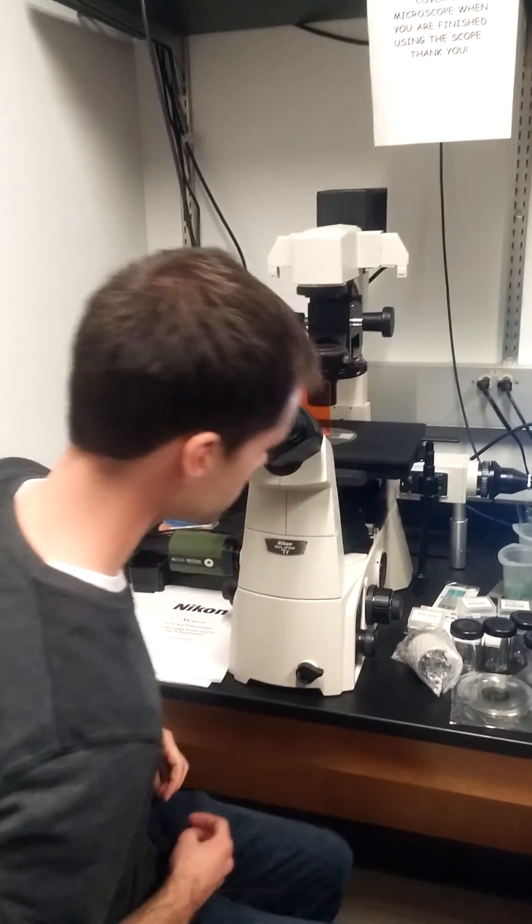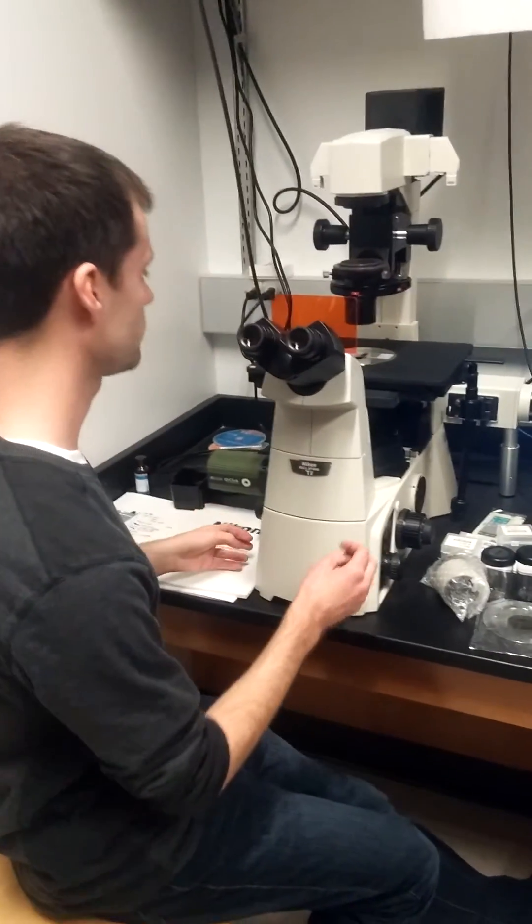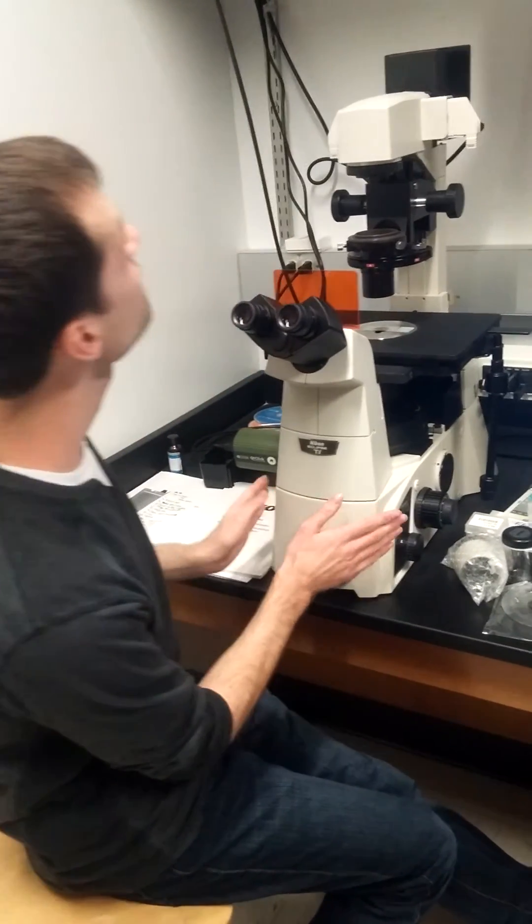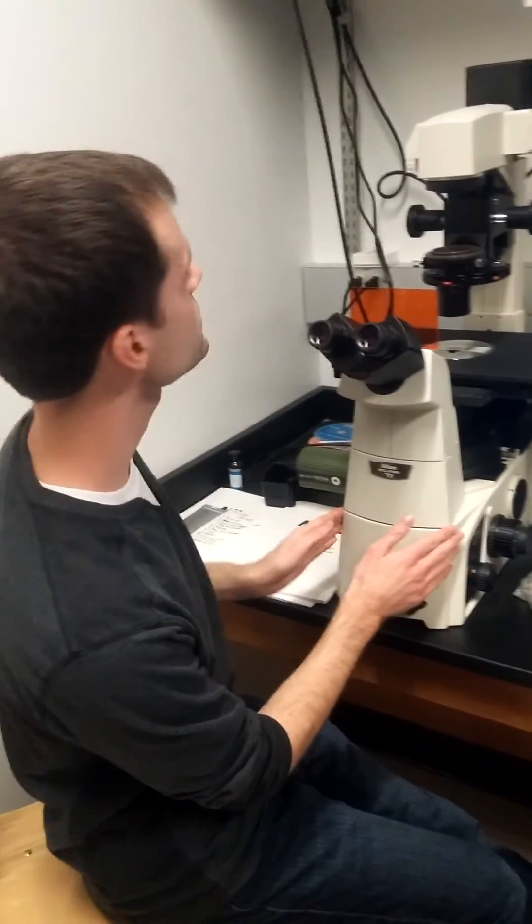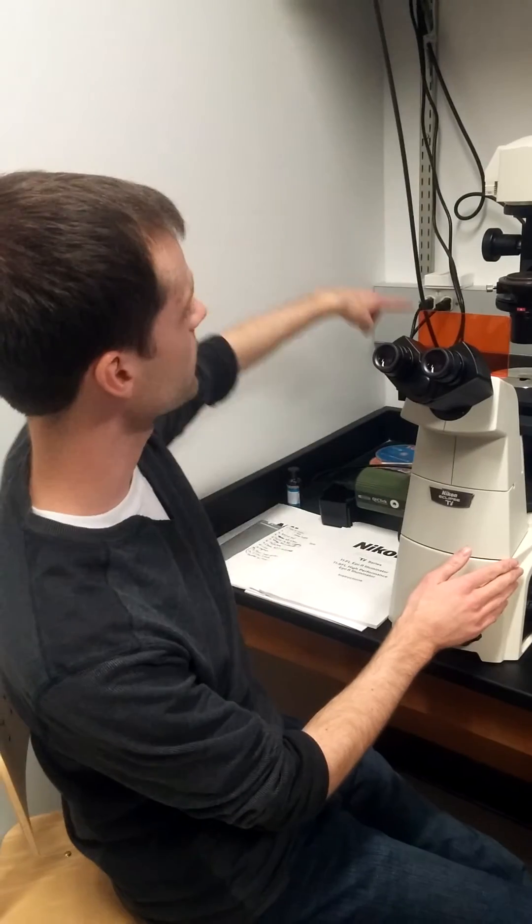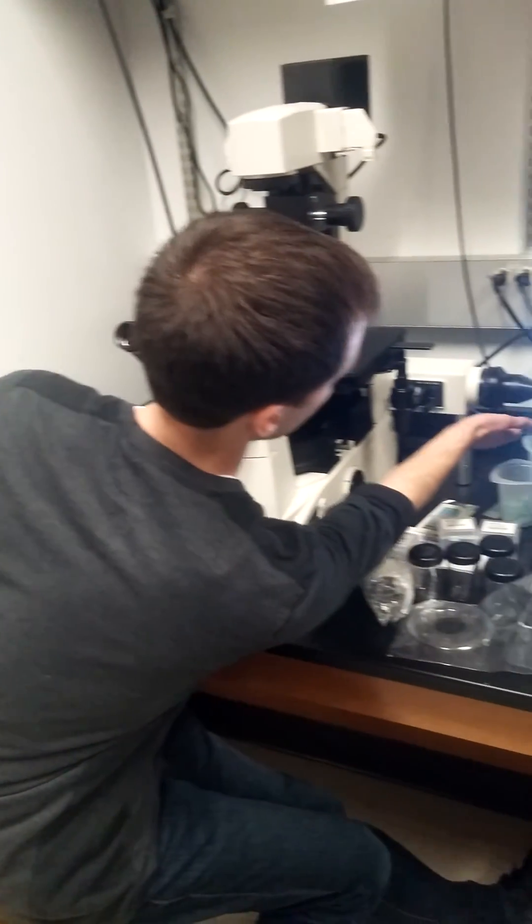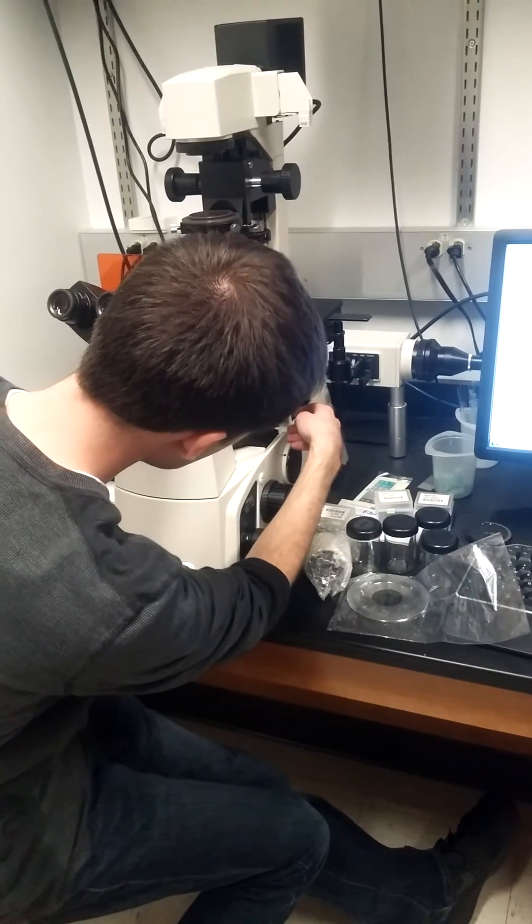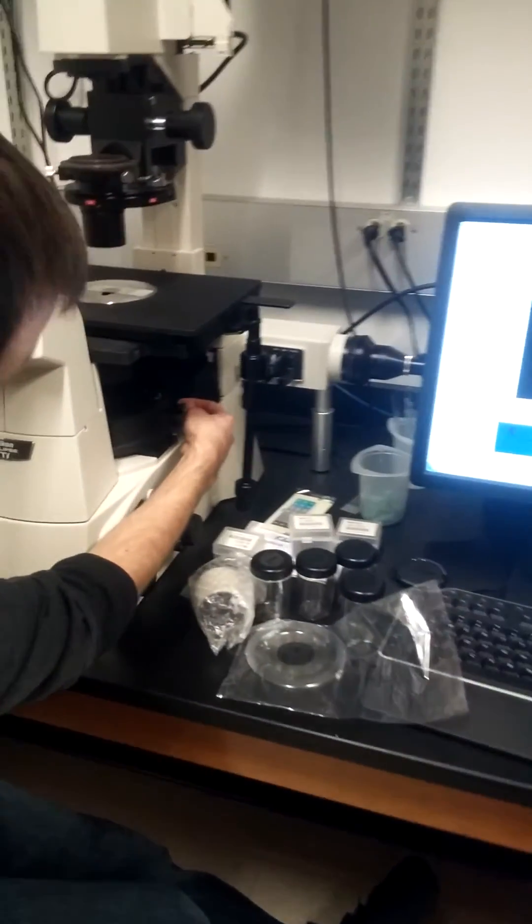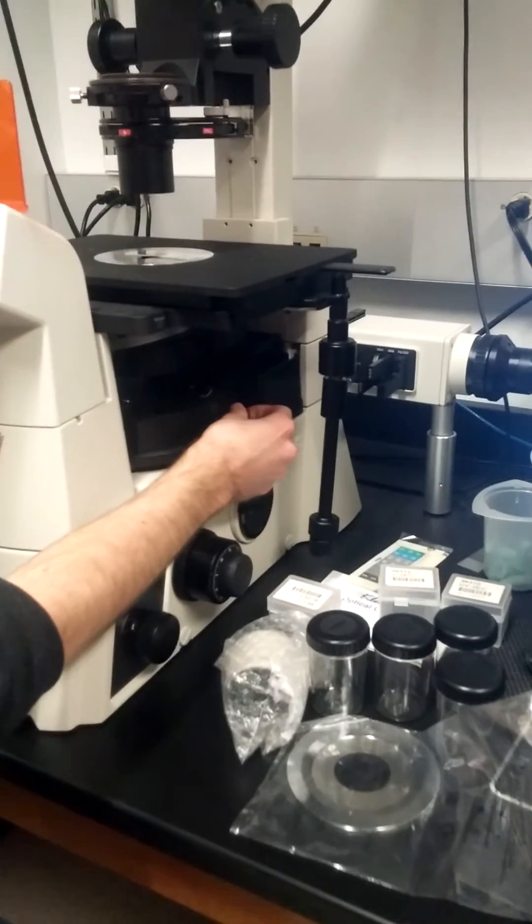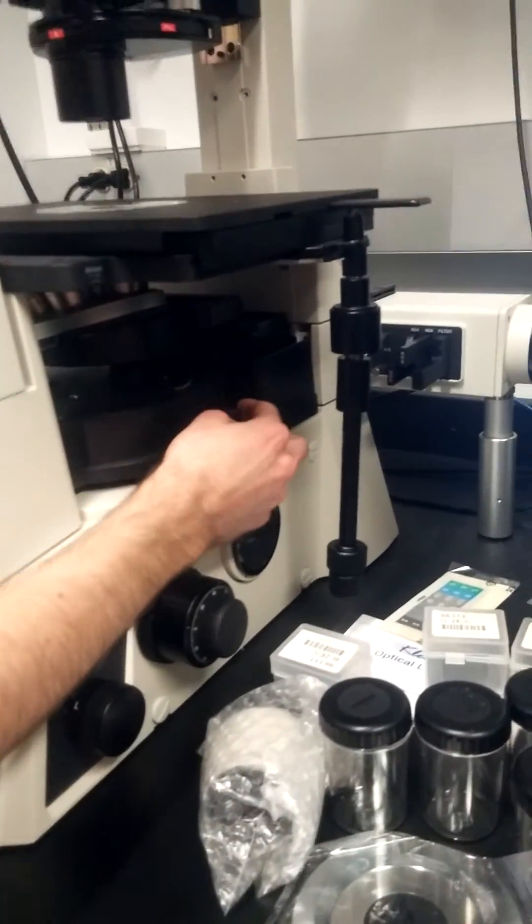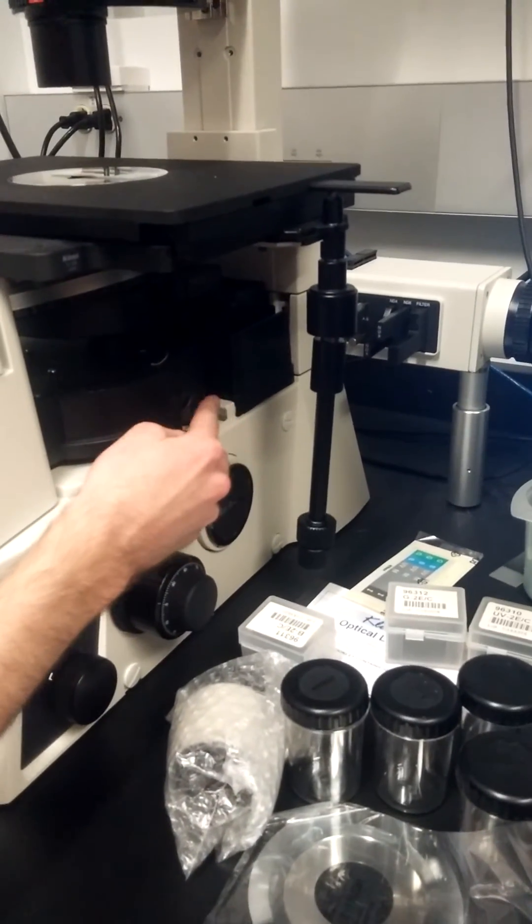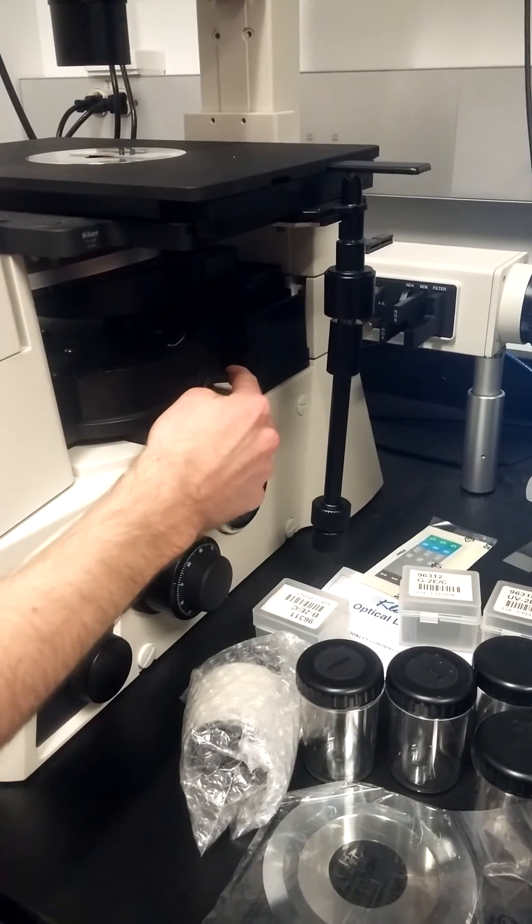To adjust how the fluorescence enters the microscope, it's going to run through this fiber optic cable here into here. And essentially we can shutter whether or not the fluorescence is making its way to our specimen by opening and closing this dial here.